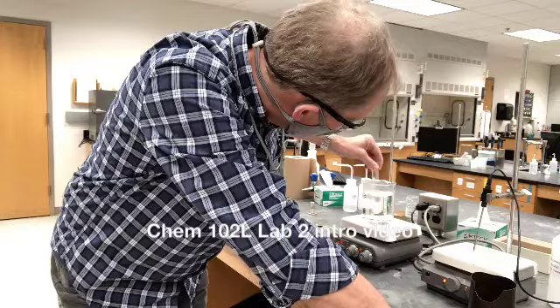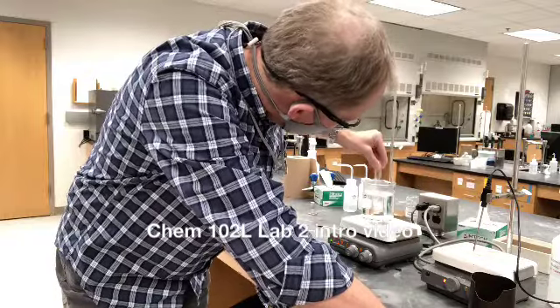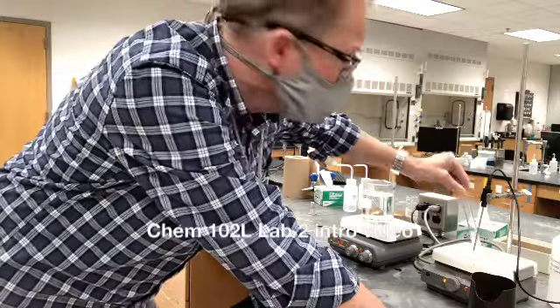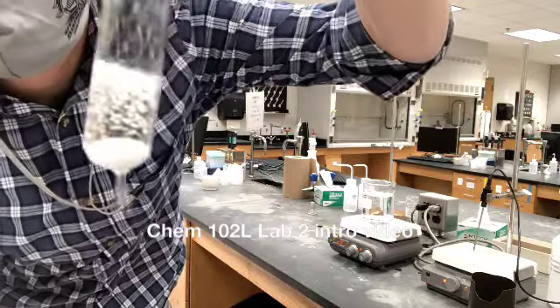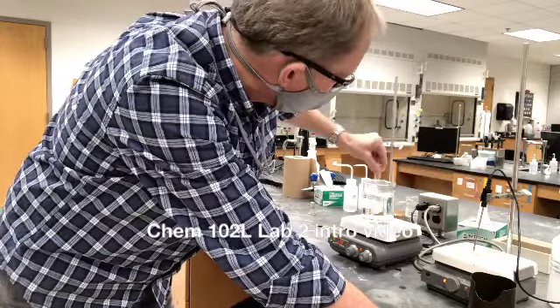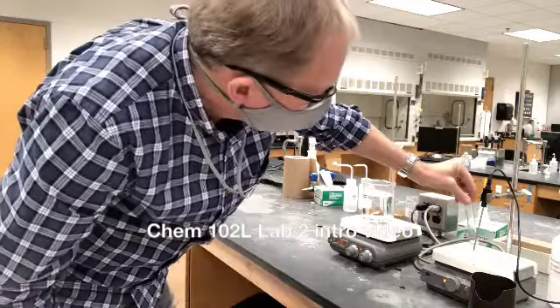And if I want this to stir a little bit, I can stick it over here on my stirrer, come back over here, and we're almost completely dissolved. So the next trick is something chemists have to do, which is to judge that we've got complete dissolution of our solute. And here you can see that there's still particles in there. So I stir it a little bit. Stirring helps. Heating is important. Stir a little bit.